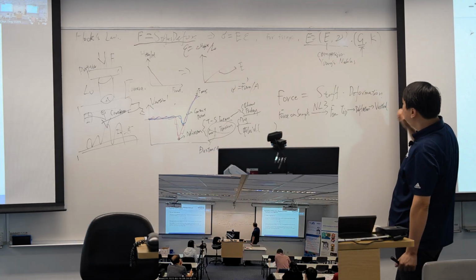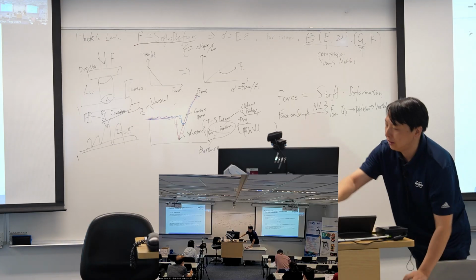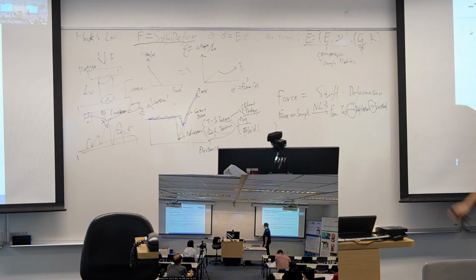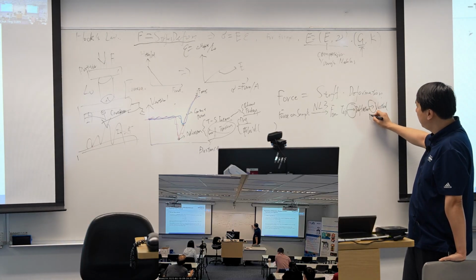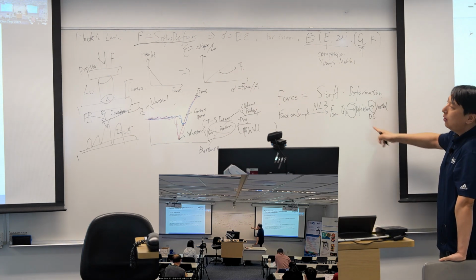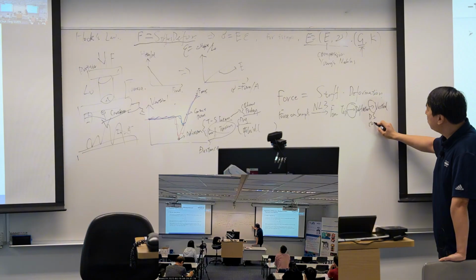We actually monitor vertical. We want force on sample. So we need to calibrate this one and this one. And from vertical to deflection, we actually use this AFM technique. They call it deflection sensitivity. And to capture that, we do this force curve on a super hard material. Usually it is sapphire. But we need it to be a clean sapphire.